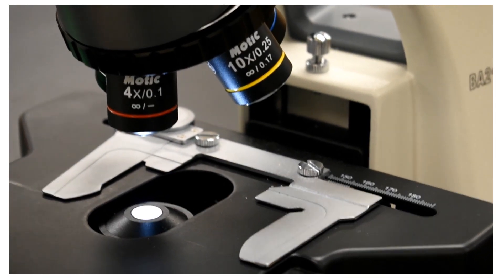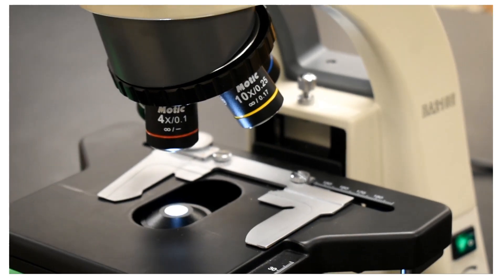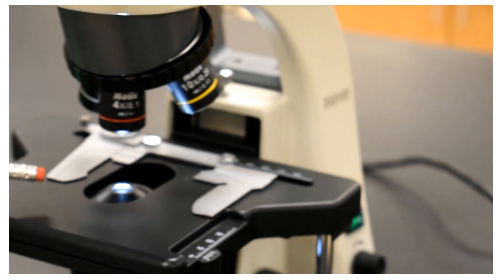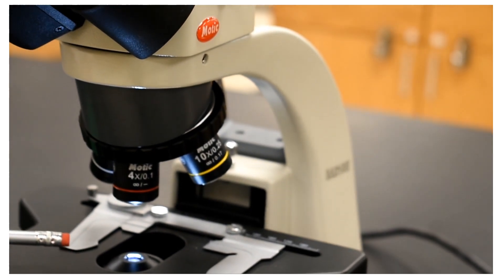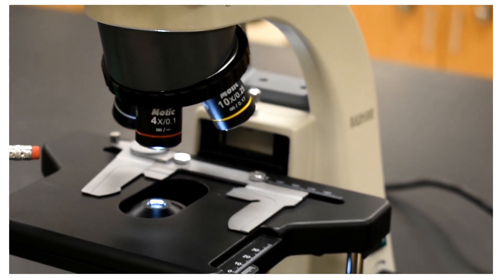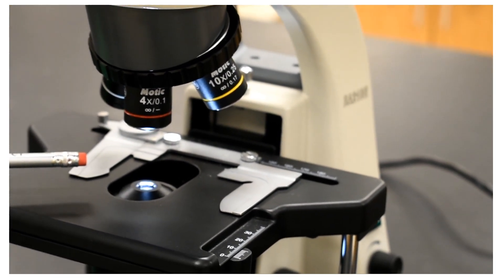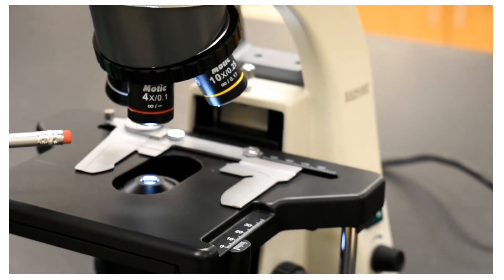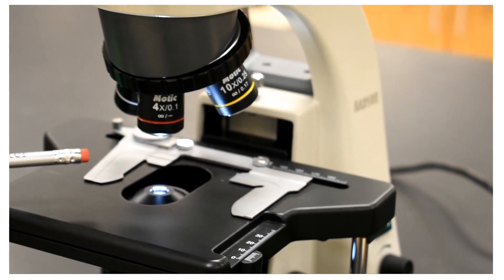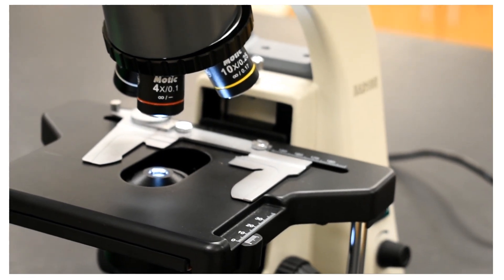There is a similarity between the microscope and the optical instrument in our eye. In our eye this is done automatically — depending on the amount of light coming in, we can control that iris diaphragm, which controls the opening called the pupil in the human eye.